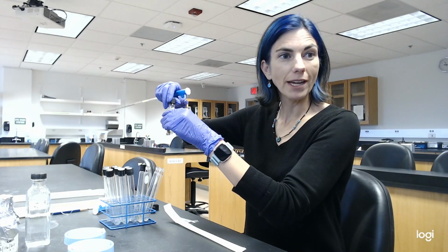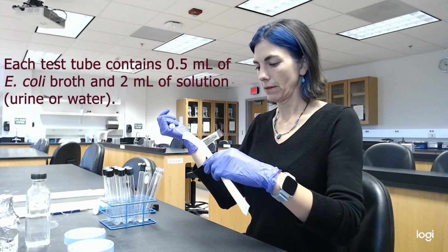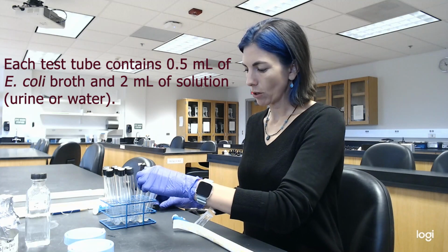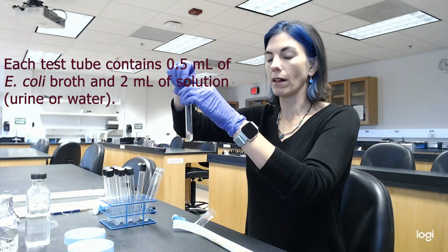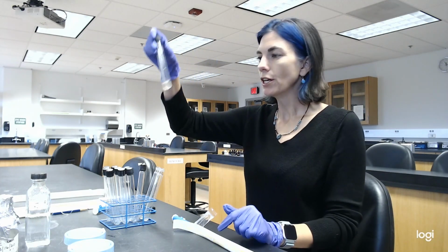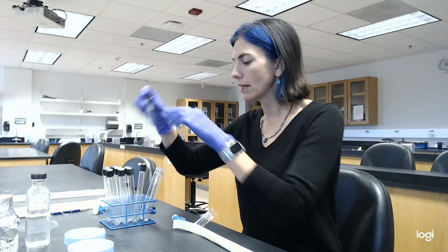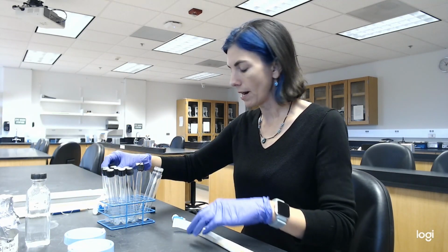And I apologize, I misspoke a little earlier. I did 2 mils. That'll give me a total of 2.5 mils, which will allow me to take 1 mil from 2 different time points out of here with a little bit left over. So I did 2 mils, so that means that to keep it consistent, I need 2 mils of the appropriate urine as well.